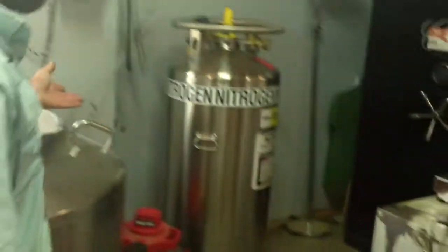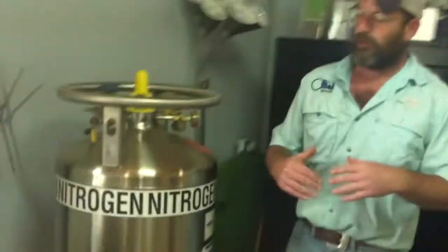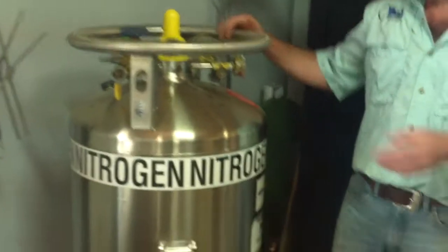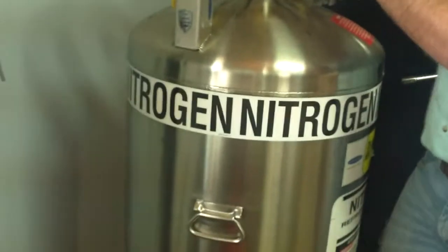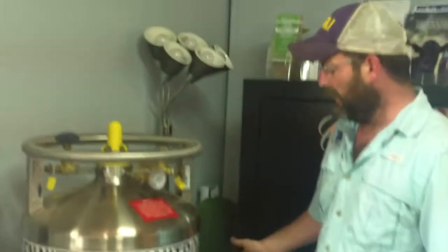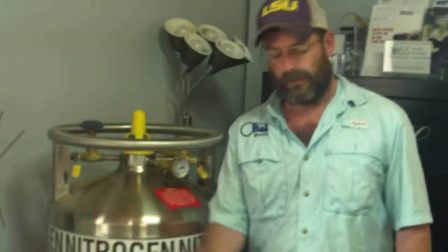You can see this is another form of a nitrogen tank. Nitrogen is a liquid that emits as a gas — you can see that when it comes up it burns off in the atmosphere, so we have to replenish it. This is just a pressurized nitrogen tank that we use to fill our other tanks. It's commercially available — we get it delivered just up the road here.